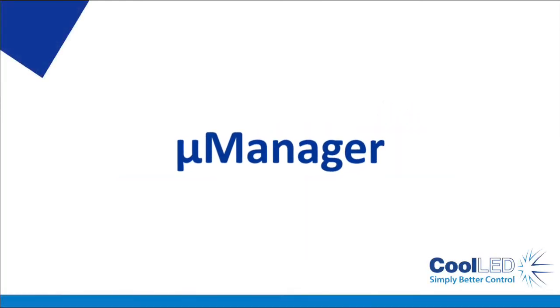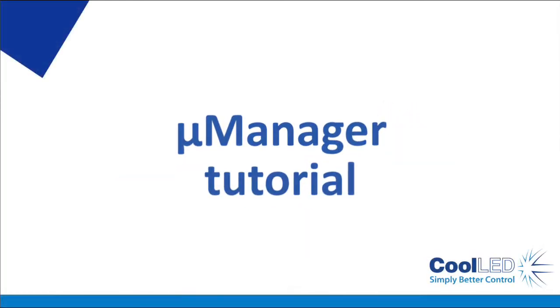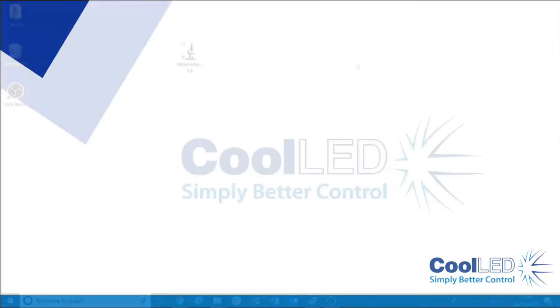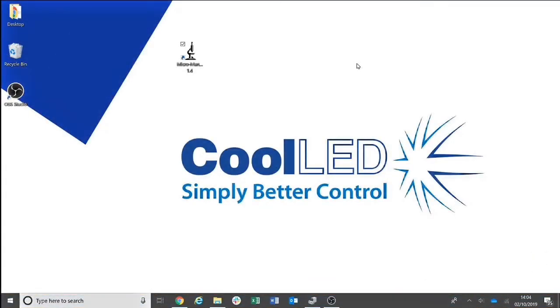Welcome to the CoolLED tutorial video for Micromanager. In today's tutorial video, we will show you how to set up the PE300 Ultra, White and pE-340fura in Micromanager.